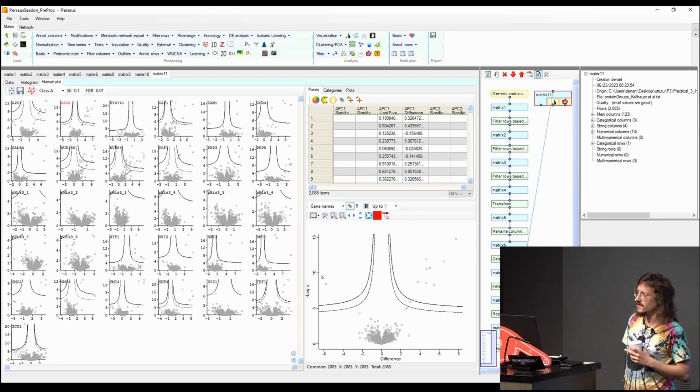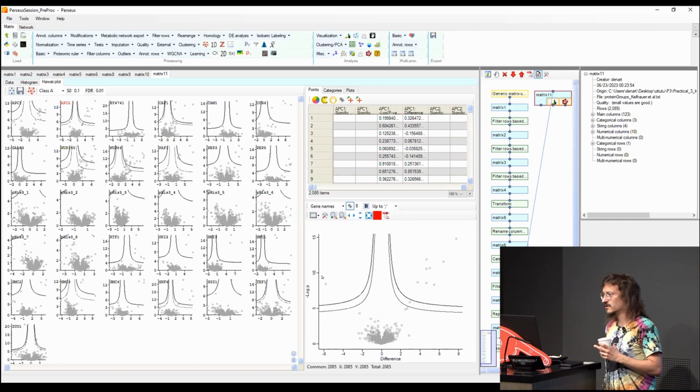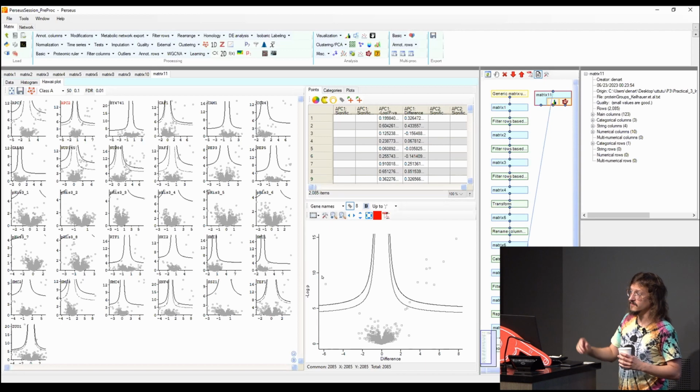And I would say also that the imputation, since in this case it is working more for lower expressed proteins, is not going to change drastically the information about your specific binders, because those should be there every time. If you have a specific binder that ends up as a missing value in the condition that you're testing, then probably that wasn't a specific binder. So just make sure that you get a nice background to make the t-test against, basically, right? But it doesn't change much, as Carlo says, the actual binding proteins.